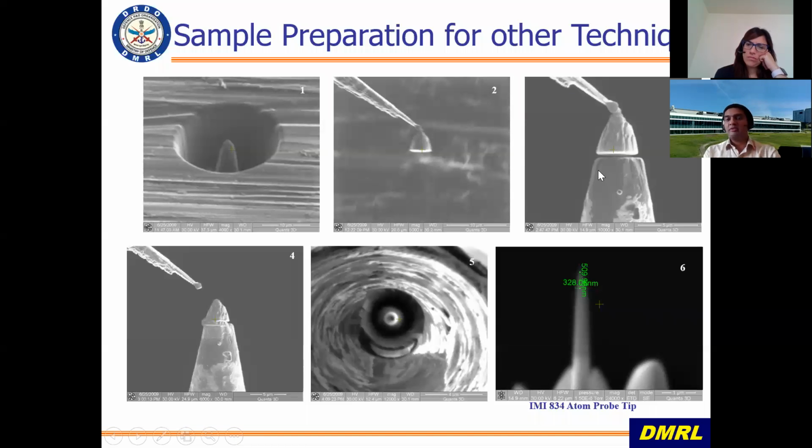And then in the final study, we can study using the atom probe, where we use high voltages to field emit the different ions from the tip of the needle, identify them, and build the entire structure in three dimensions. This technique actually has a single atom depth resolution, so you can know which atom is sitting where.